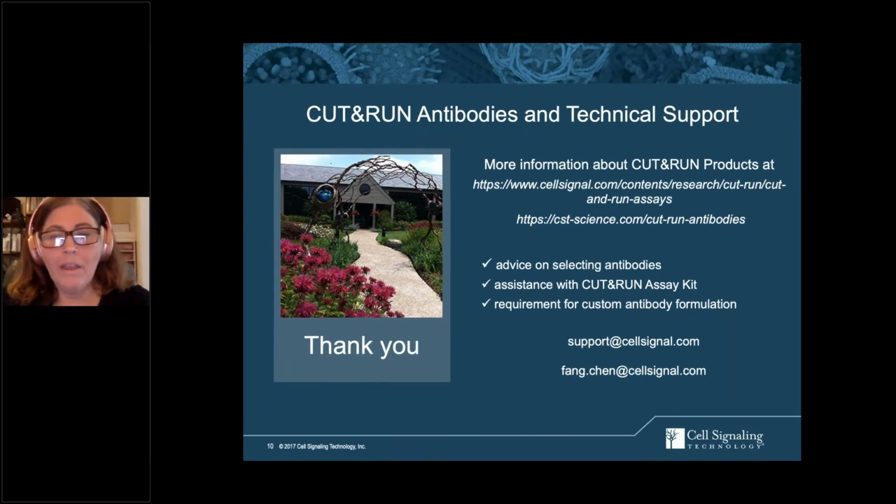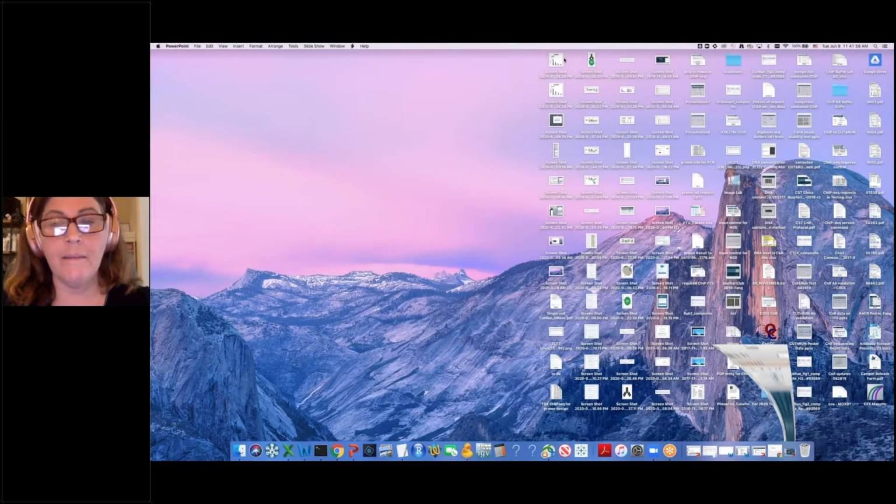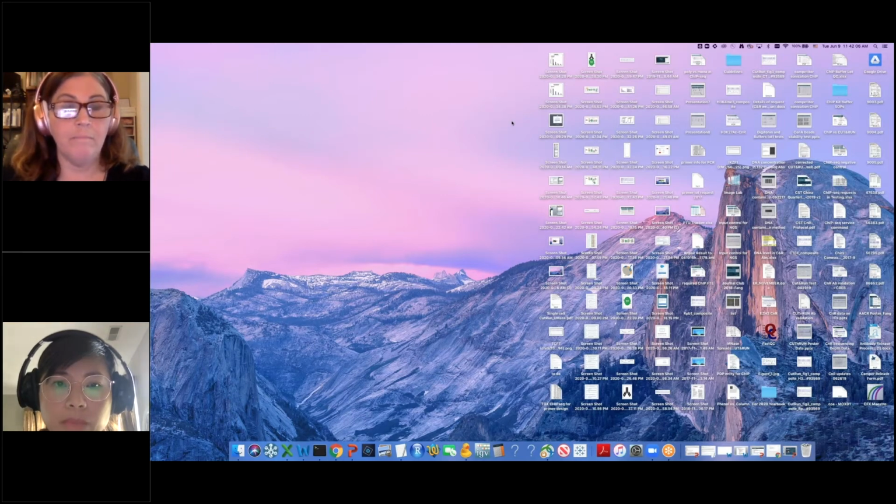Thank you, Fang. For our first question, what should I do if I am performing a time course and can't immediately perform the CUT&RUN assay on all of my cell samples? Can I freeze down my cells? Does CUT&RUN work with formaldehyde fixed cells?